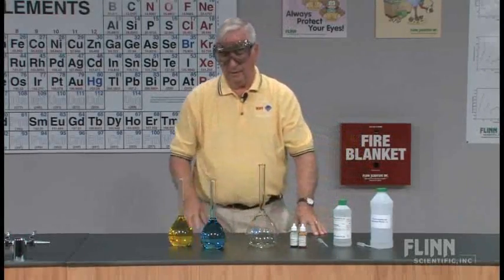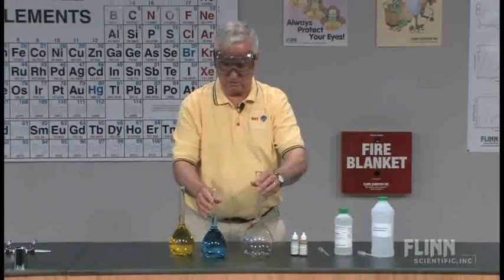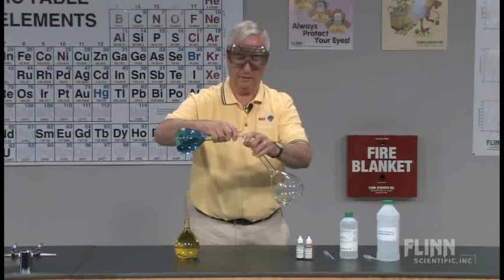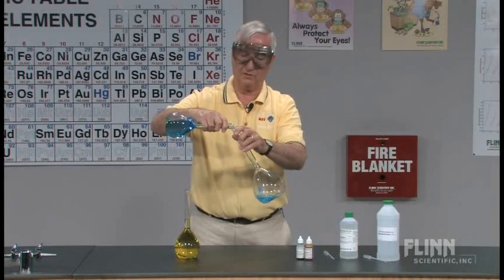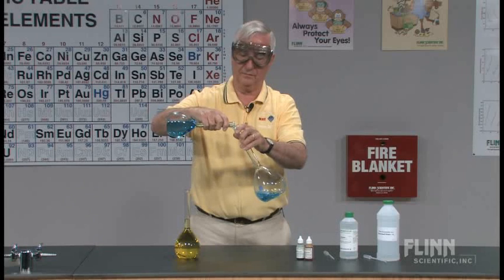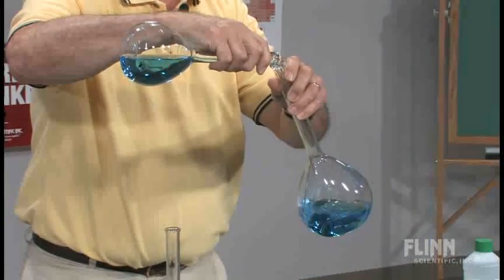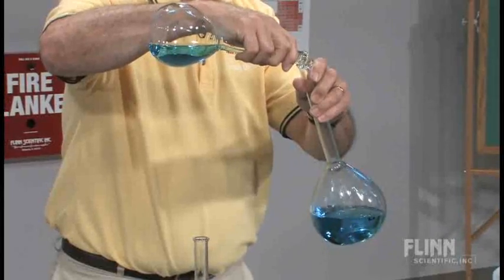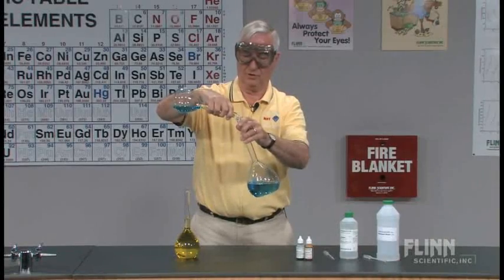Now I'm going to take a one liter volumetric flask and very carefully pour the alcohol into the flask first — 500 milliliters exactly. This is the place where you frequently get a little bit of spillage if you're not careful in pouring, so just take your time.